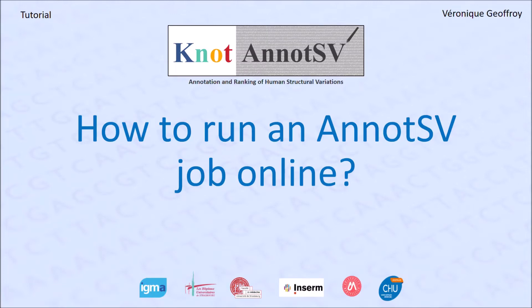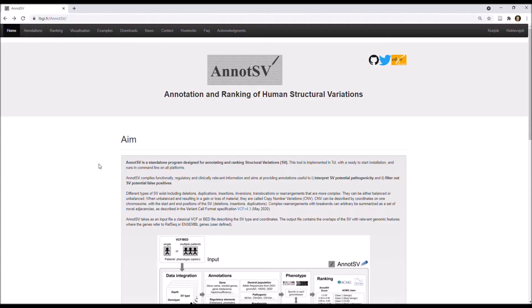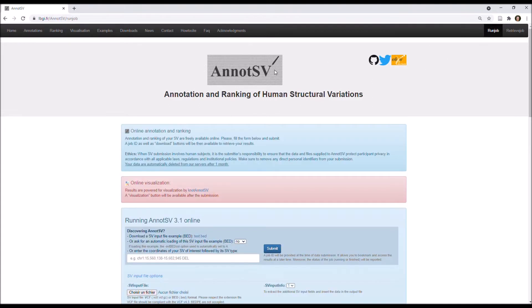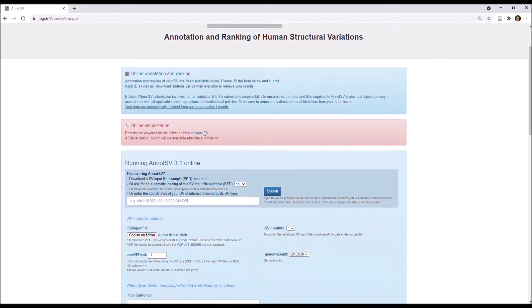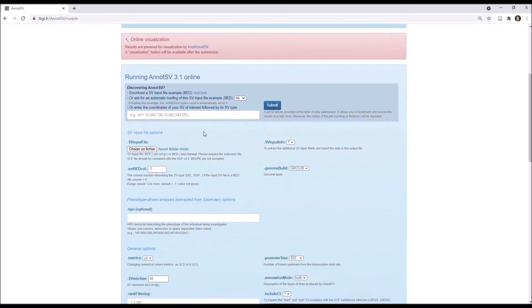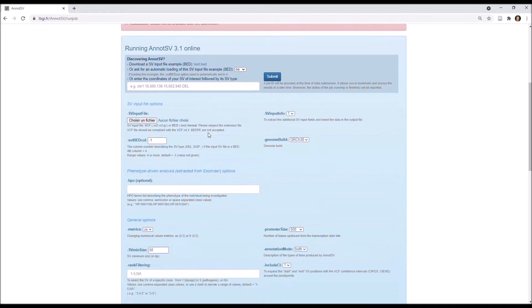Hello everybody, today we are going to look at how to run an AnnotSV job online. First, from the AnnotSV website, you can directly run a new job by clicking on the Run Job tab at the top right. This link gives you access to this submission page, and there are different ways to give an input to AnnotSV.